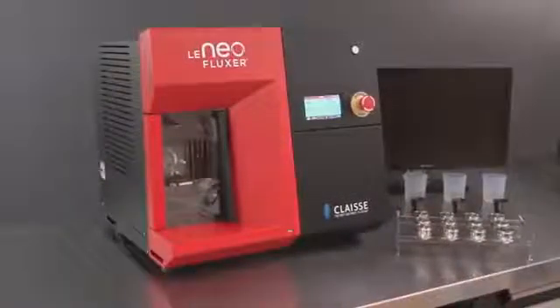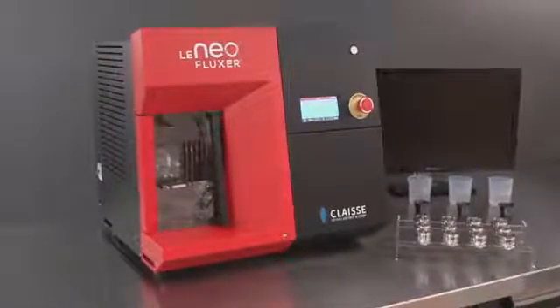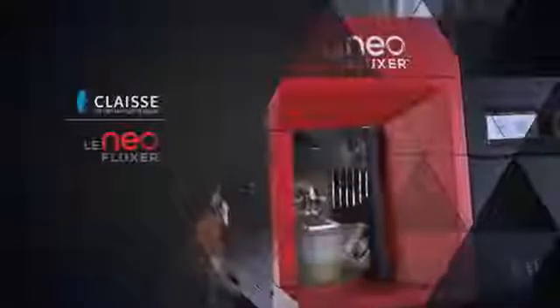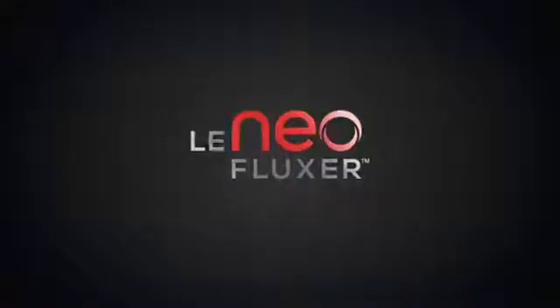The LeNeo Instrument from the Claisse Fluxer brand offers a high-quality, cost-effective, and user-friendly fusion solution that complies with the precision and accuracy requirements of stringent industry regulations and norms. With this fusion instrument, a quick return on investment is guaranteed.